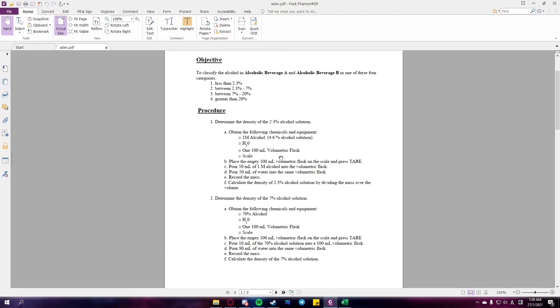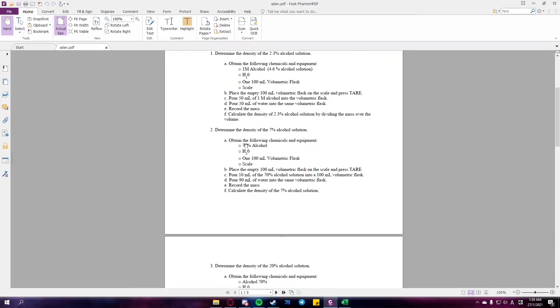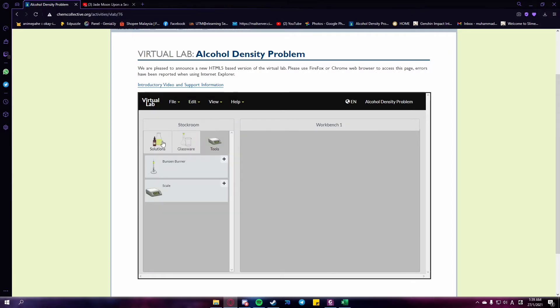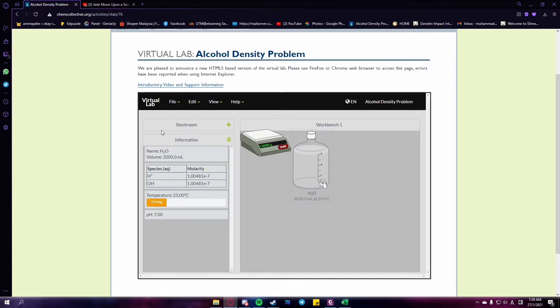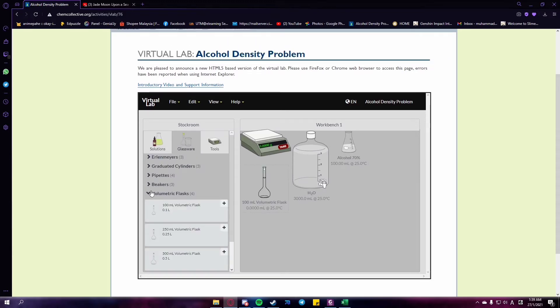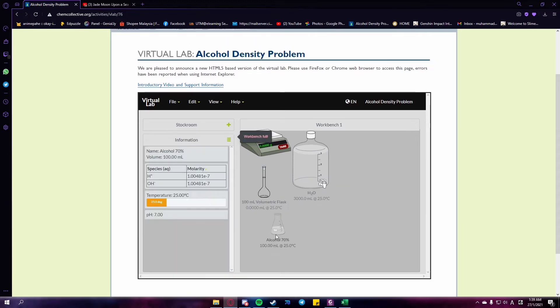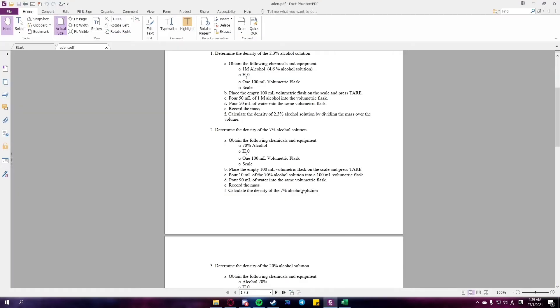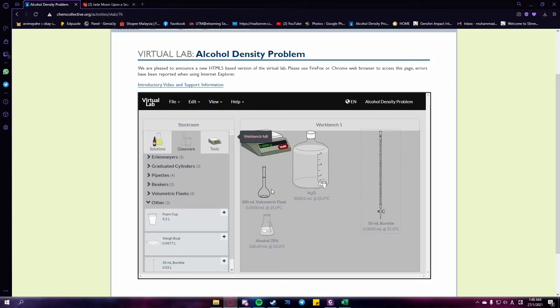Next is procedure 2, which is to determine the density of the 7% alcohol solution. In this procedure, we need the same equipment as in procedure 1 — water, a 100 ml volumetric flask, and a scale. But in this procedure, we use a different percentage of alcohol: we use 70% alcohol.